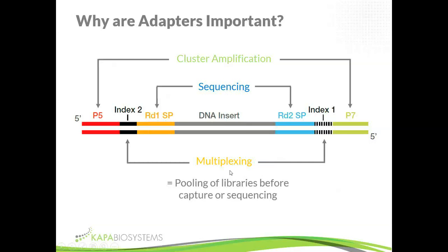If you're sequencing microbial genomes, you can sequence up to 1,000 on an Illumina flow cell, or on a single lane, depending on the size of those genomes. Some microbes are pretty small, and you can put a lot of them in there and still get the 30 or 50 or 60x coverage that you need.